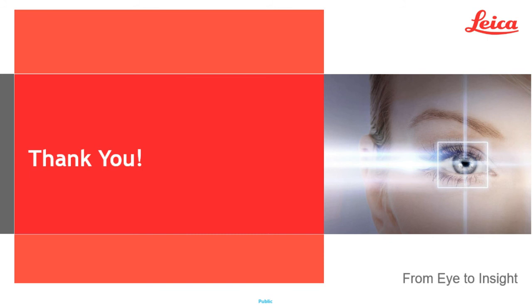Thank you so much. Now, Dr. Tran, what features do you use for random forests? This is kind of a broad selection, and I have to be honest, I don't know which ones I use off the top of my head, purely because with Avia, which is the software I'm currently using to do the processing and what I've used to showcase the examples here, we have a set of default features that we use.